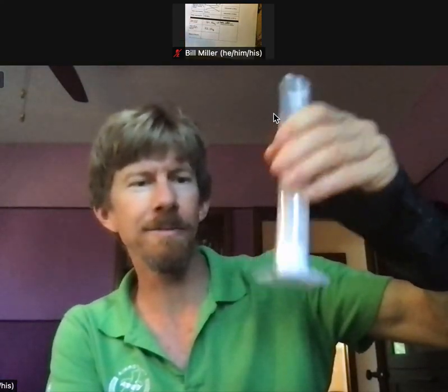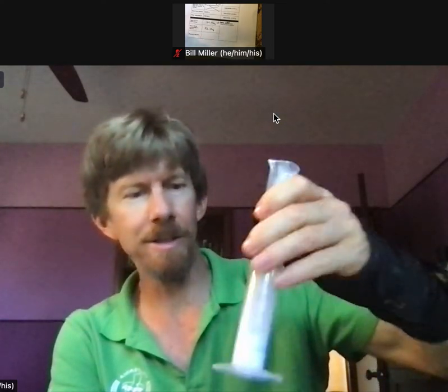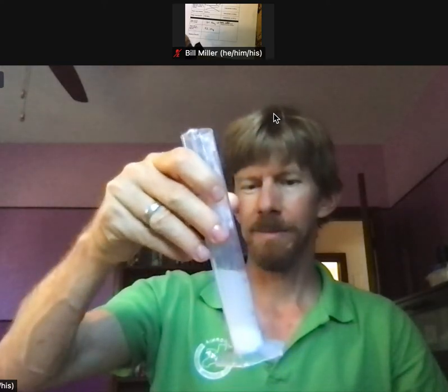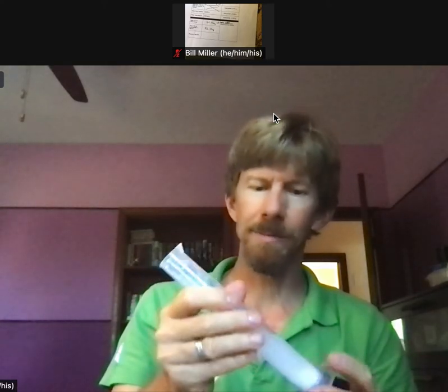All right. And so now the harder question is, how do we get this stuff to dissolve? We have to mix well without spilling, no inversion. So we're just shaking this, swirl, swirl, swirl. And the question is, am I going to get a big clump down there like I did sometimes before? I do need to get all the stuff off the side though.